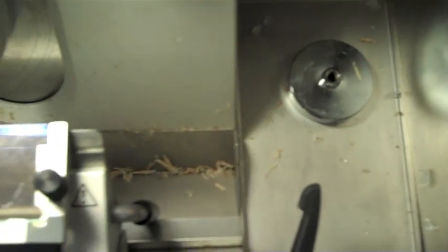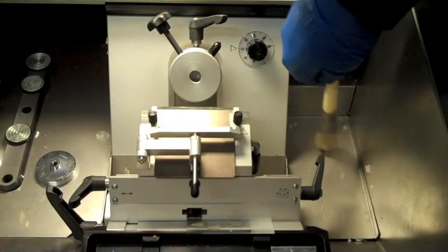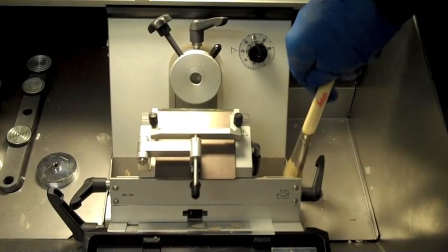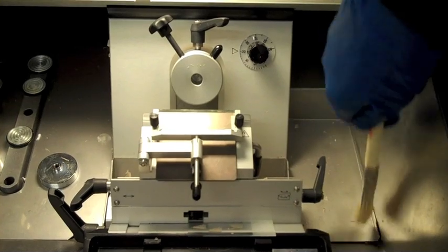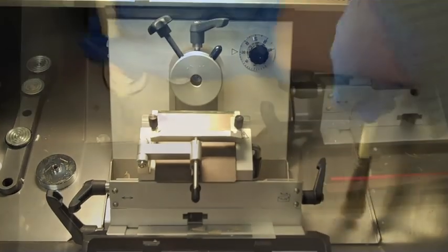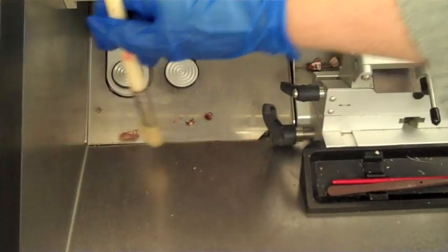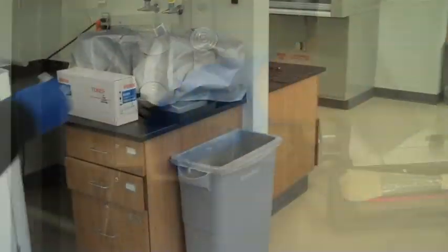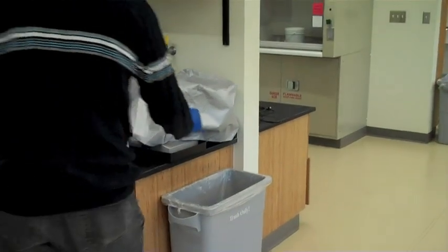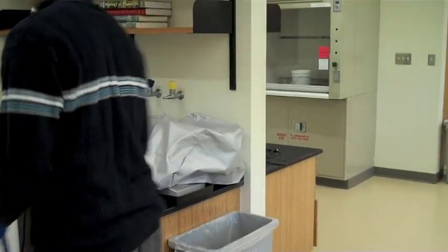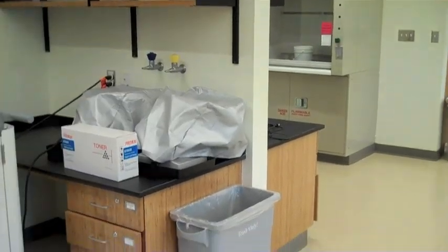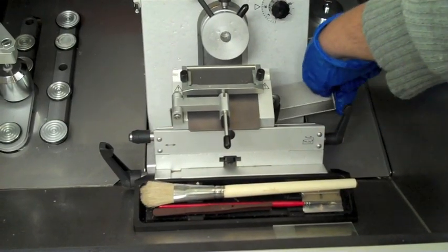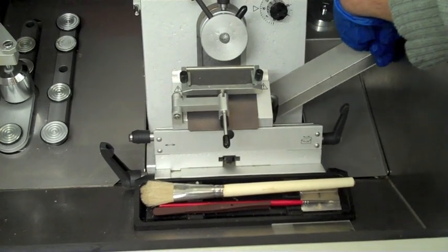By this time, the cryostat will be a mess. Don't forget to clean it. Use a brush to make a pile. Collect the debris with a kimwipe and then throw that kimwipe in the trash. Make sure you empty the trough of debris too.